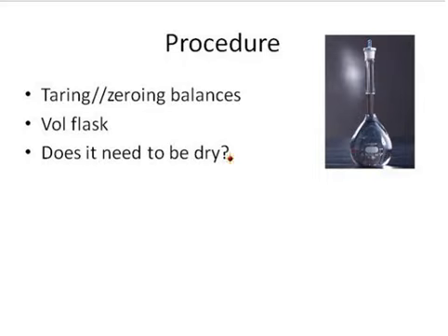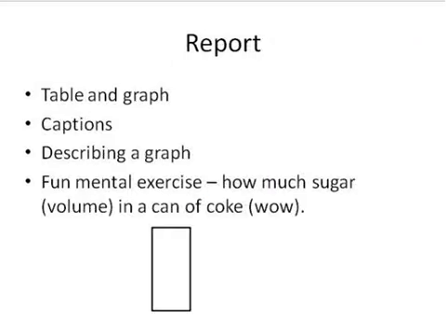Be sure that you're clean and careful when you're working with the scale, with the balances, because the balances can be very precise and accurate instruments if we take good care of them. So the last bit is about writing the report. So some suggestions on writing the report.